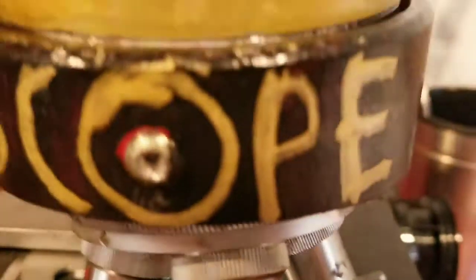They're not very high resolution, but I have finally succeeded in my goal of looking at bacteria under the microscope. They're not moving. However, they have been on the plate for a really long time, and I kind of suspect that they are all dead at this point.